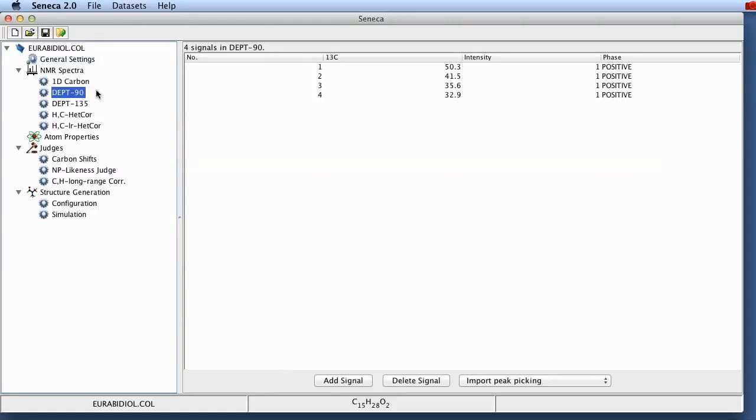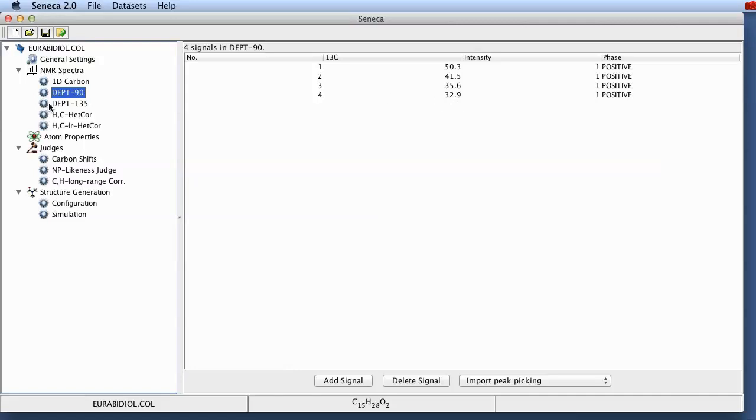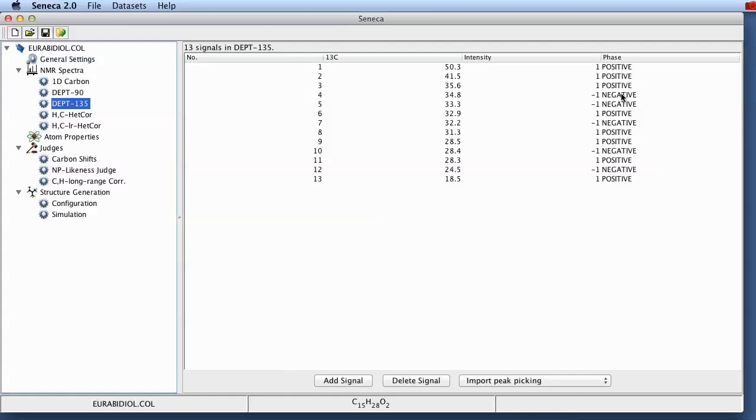The DEPT 90 spectrum contains only positive signals for those carbon atoms that have exactly one hydrogen attached. The DEPT 135 has positive signals for those carbons that have one or three hydrogens and negative signals for carbons with exactly two attached, directly attached hydrogen atoms CH2 groups.